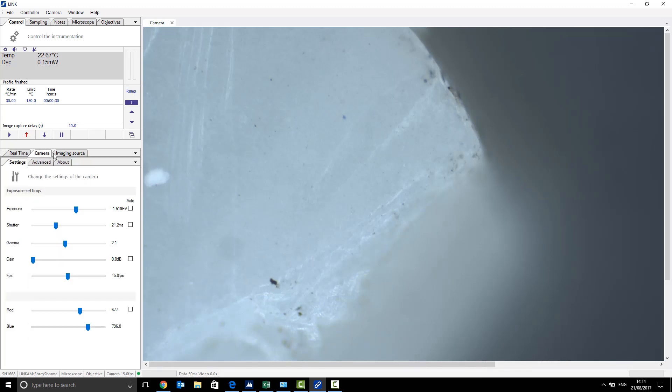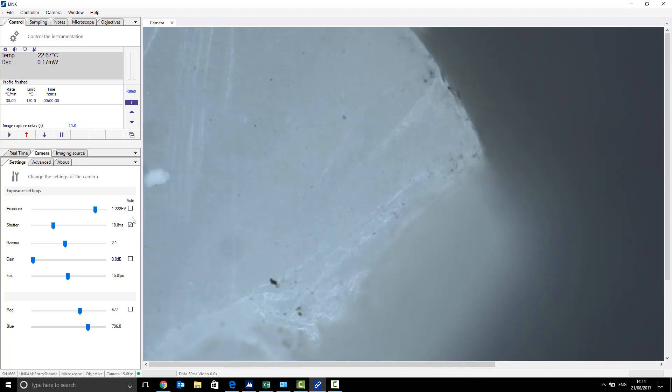On this camera tab over here, you want to make sure that the auto is deselected. This way, it will stop the image from changing during a run, which would affect your task results.